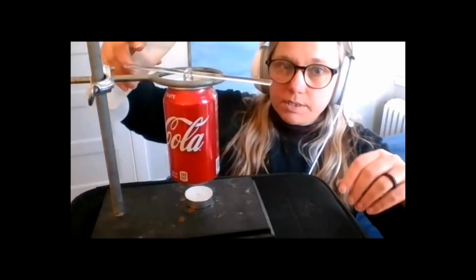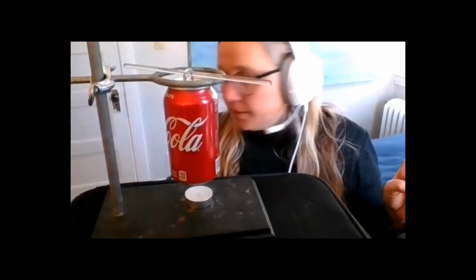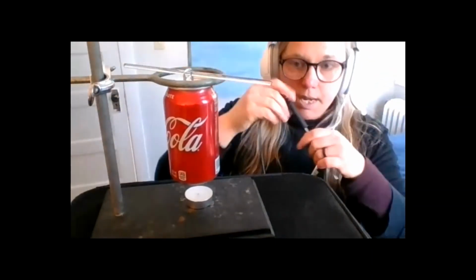Okay, so then you pour the water into the can, all 99.3 milliliters or whatever it happens to be. Put all that into the can, and then you're going to want to set up your thermometer. And let me show you how to set up the thermometer.